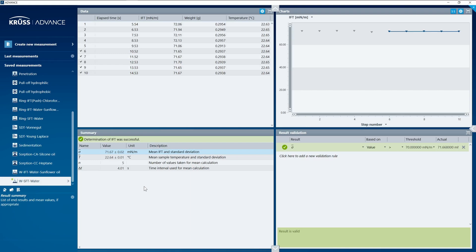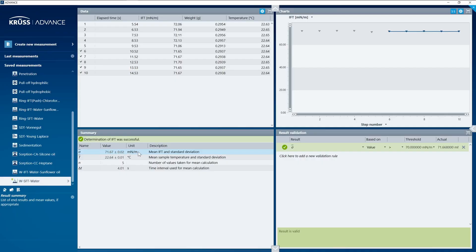So in this case I told Tensio to take several measurements and take an average. So at the bottom I have that average surface tension value—in this case for water.